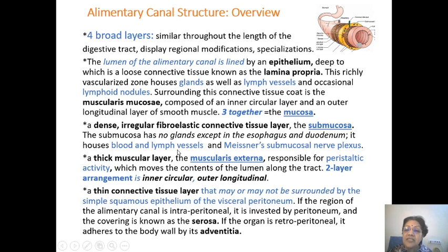The blood and lymph vessels are therefore important. It may not be very prominent in this small picture, I don't know if you can make out, please try to see. There are arteries and veins together in this yellowish orange layer where you see these vessels. So you're seeing cut sections of the smallest branches of the incoming arterioles and venules, and in the slide also you will be able to see them quite alright.